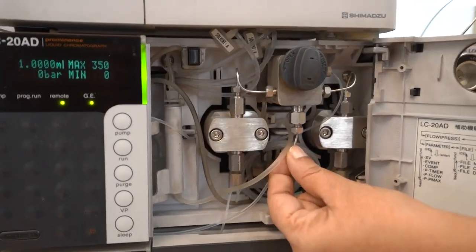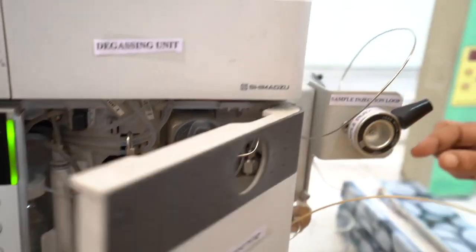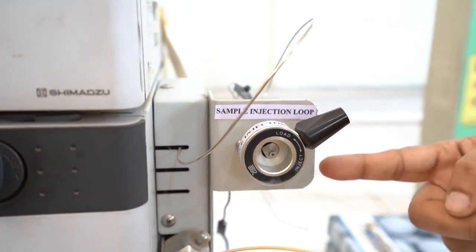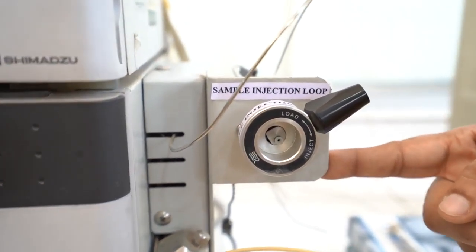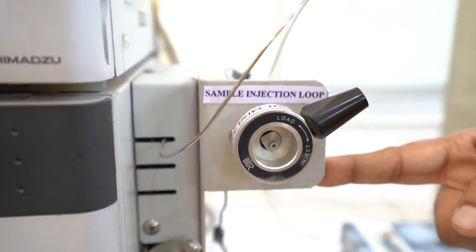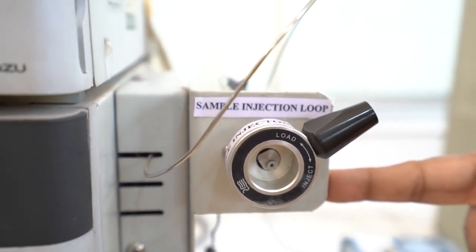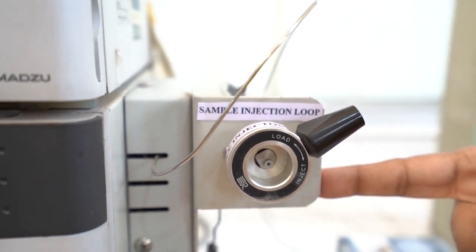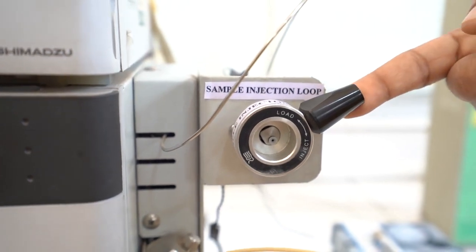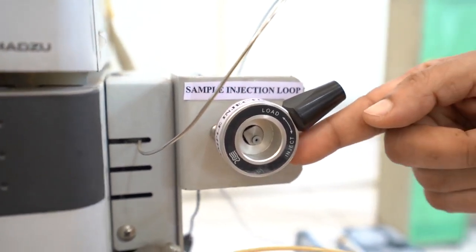The pump outlet is connected via stainless steel tubing to the Rheodyne sample injector. What you see over here is a Rheodyne sample injector. This injector is designed to deliver accurate volumes of the analyte onto the head of the column, providing reproducibility of sample measurement. The Rheodyne sample injector has two positions marked on it, the load position and the inject position.